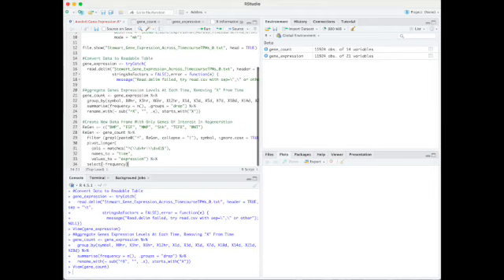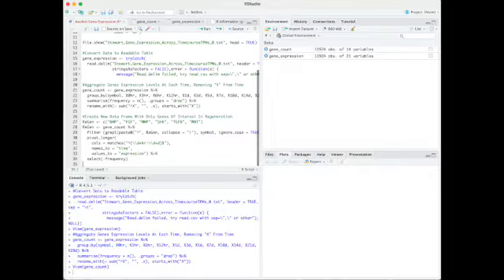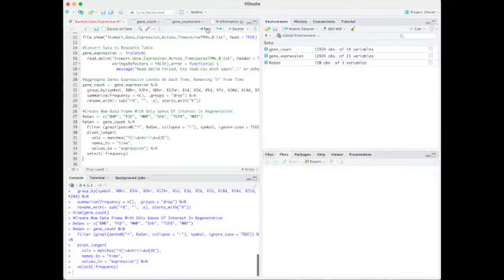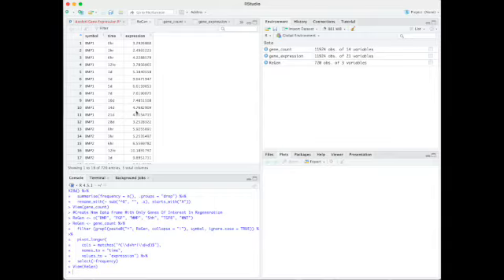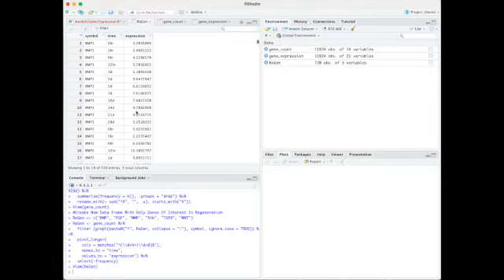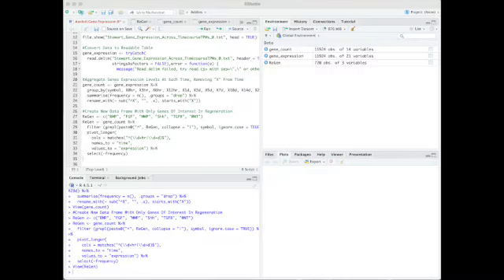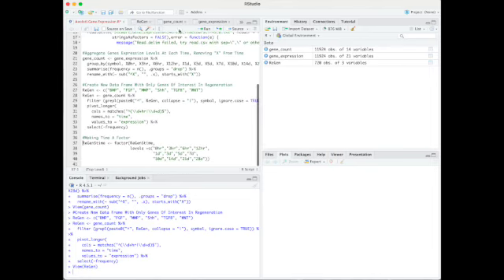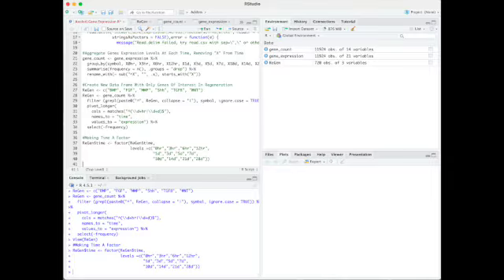Using filter to filter the genes in gene_count and grepl to search for the specific matches allows us to capture each unique gene within the data, as well as making the data frame into a longer format using pivot_longer. This is easier for us to graph with later on. We also need to make time a factor. Because the times listed are in both hours and days, we must tell R to keep them in this specific order, so they appear chronologically on the graphs.